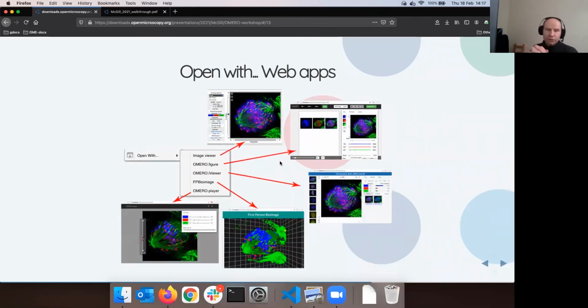We have two main clients. Remember the word client from the beginning. You will get familiar with both actually already today. The first being Omero Insight, mainly used for imports, and the second one being Omero Web. Omero Web is our main client. So basically the recommendation is use Omero Insight for imports and Omero Web for everything else. The environment in Omero Web is such that you can write plugins for Omero Web, and you can easily extend Omero Web in this case. Well, by the way, you can extend almost anything in Omero.